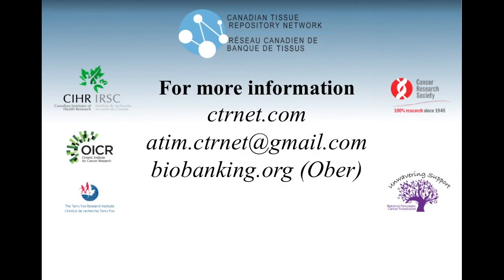The atim program is tailored to each user with customizations available on all levels to ensure your biobanking software works for you. At the same time, atim users and developers are part of an interactive community which promotes the cross-pollination of useful new features across the network, creating efficiency within the system. This produces a well-organized and efficient biobanking software, and therefore a well-organized and efficient biobank.